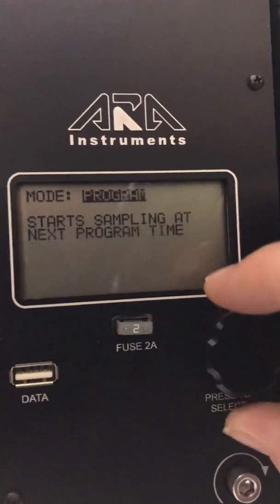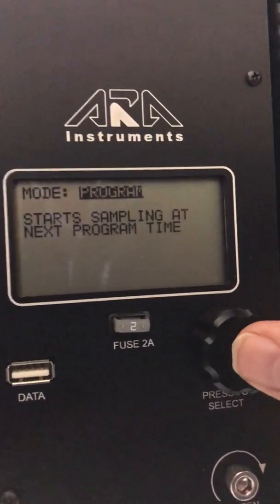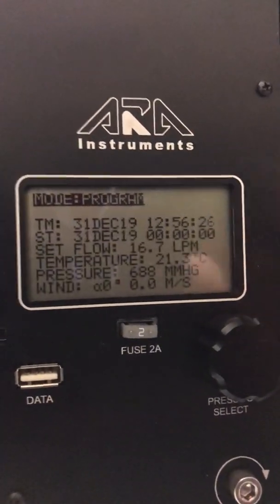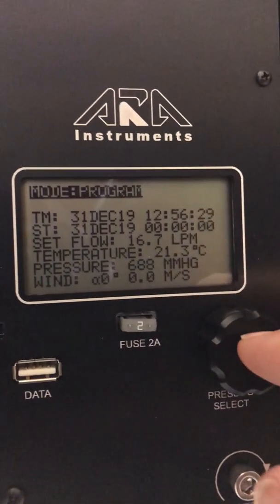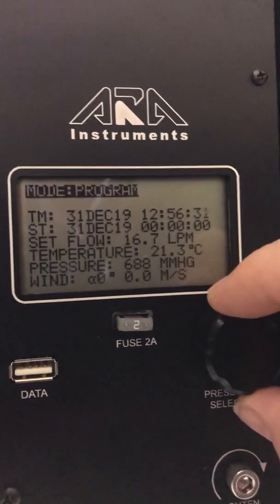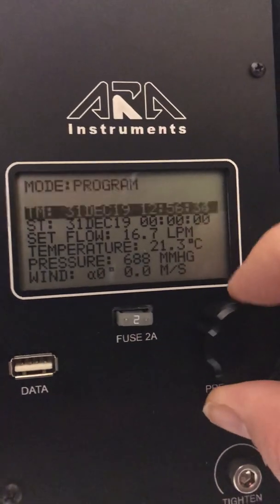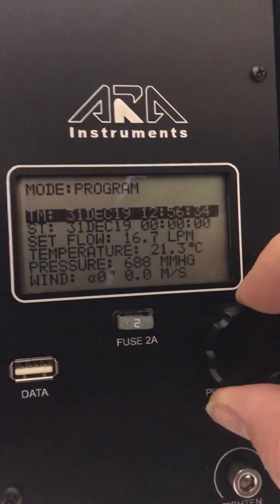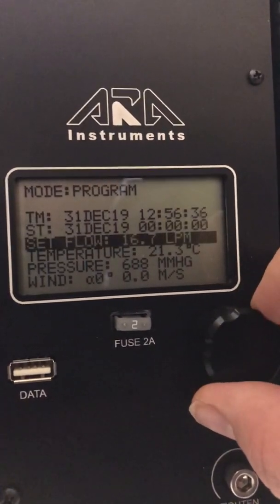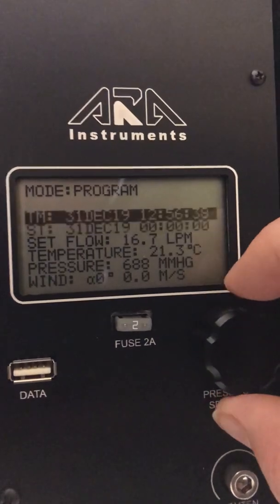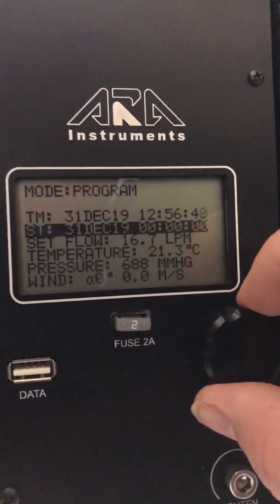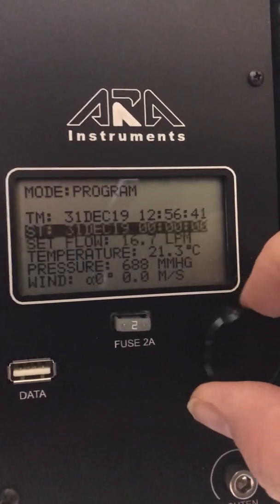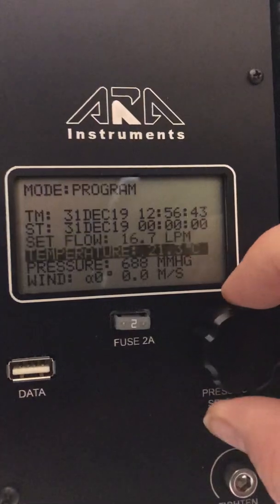The one that we would most commonly use is program, and to select it we just simply push in on this. It's really simple to set up. We're just scrolling through the menus using this knob, and then you can set your date times on this unit.